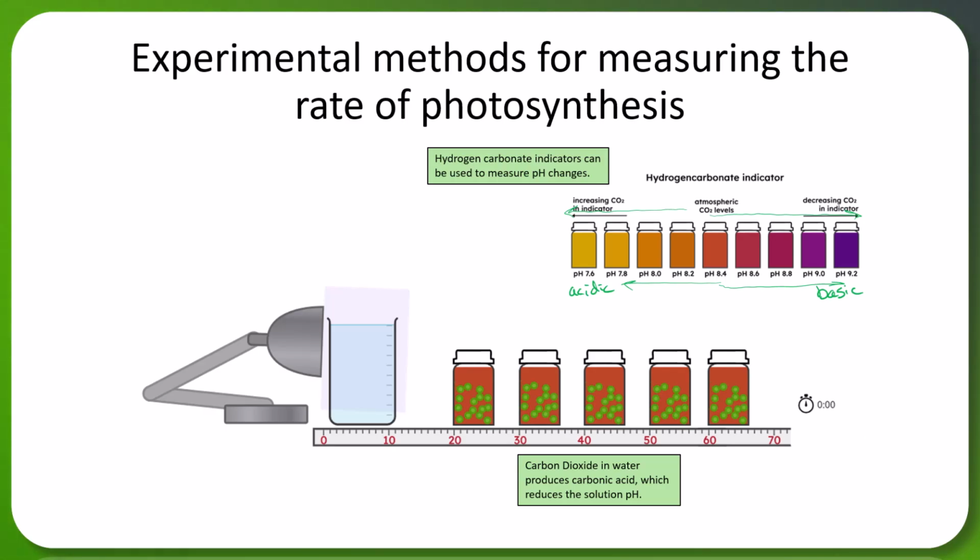And so if you change the light intensity and put our algae beads into these vials that contain this indicator, and photosynthesis is working really well, CO2 would be decreasing and therefore would be turning the vial more purple. If photosynthesis isn't working very well, or if cell respiration is outpacing photosynthesis, you would expect CO2 to be produced, and that would cause the indicator to shift more to this higher CO2 indicator range, which would be yellow.